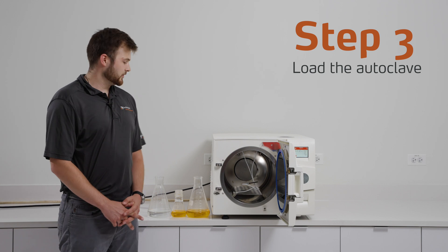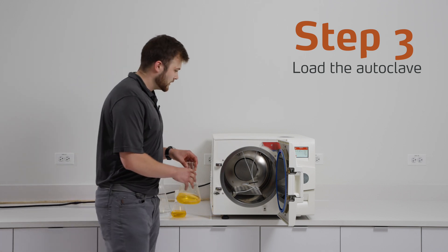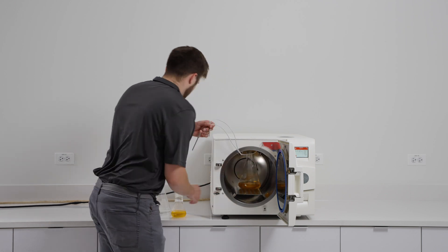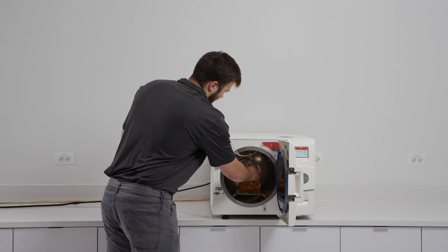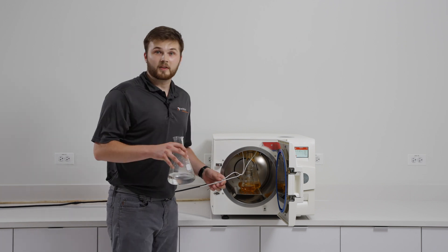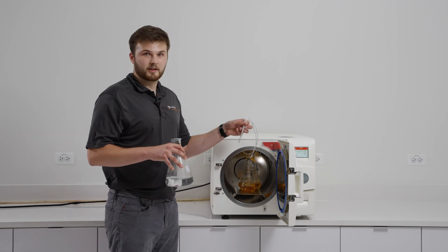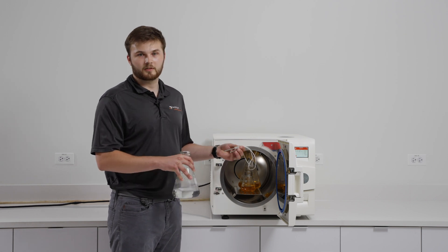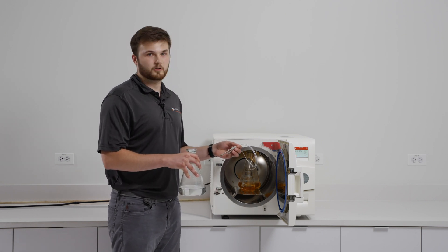Now that you have prepped your media, you are good to start loading your autoclave. Please make sure to put your media in the back of the unit, and the control vessel far to the front. The reason for that is because the probes are located at the front, and it is way easier to just stick them in that control vessel if it is located at the front. It also makes unloading the autoclave much easier.